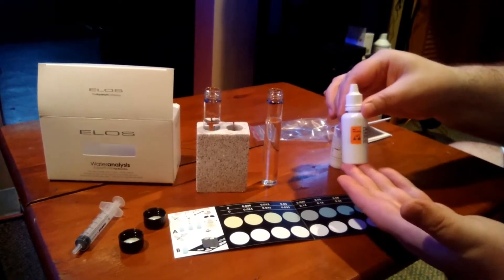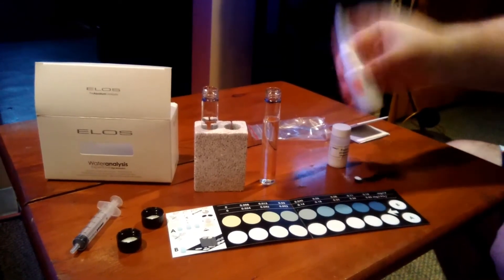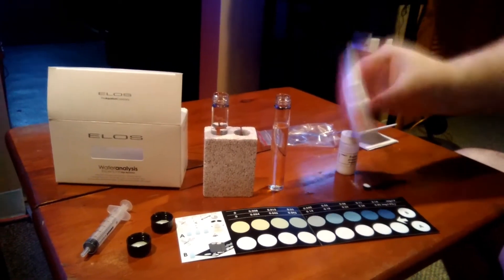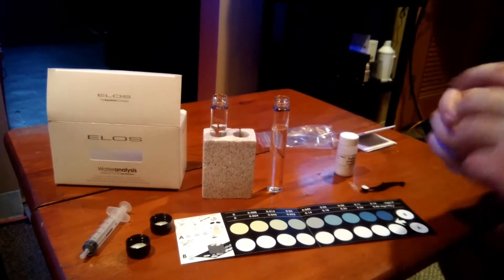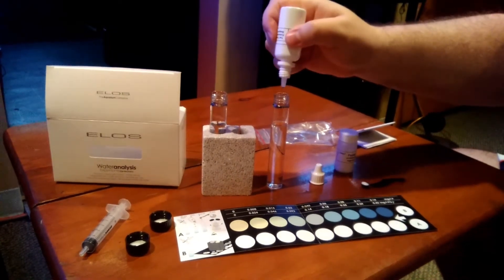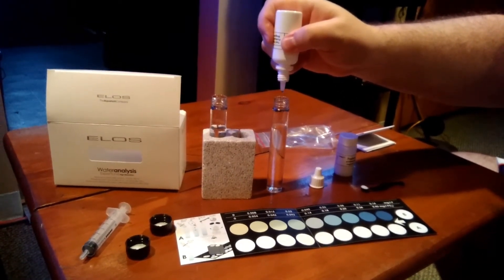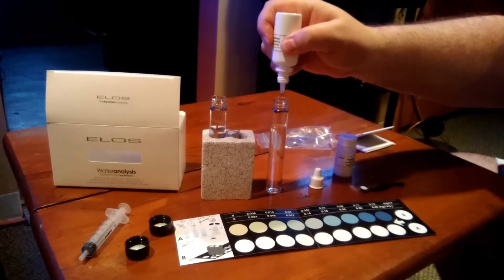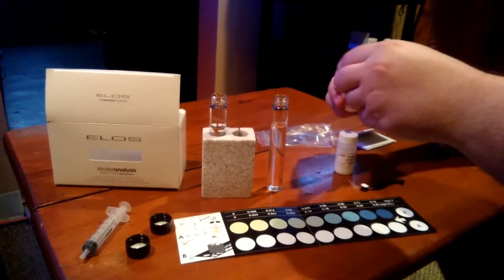You're going to take the first reagent — the liquid — and shake it up. You're going to be adding 10 drops: 1, 2, 3, 4, 5, 6, 7, 8, 9, 10. Then you're going to recap that right away.